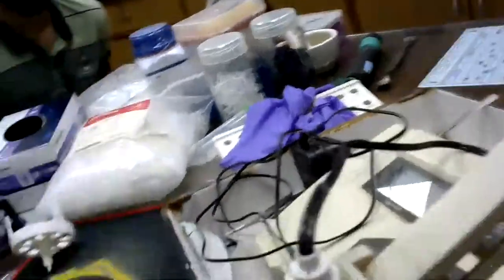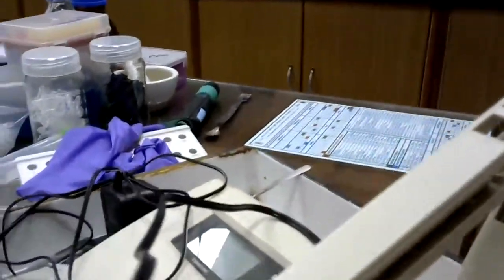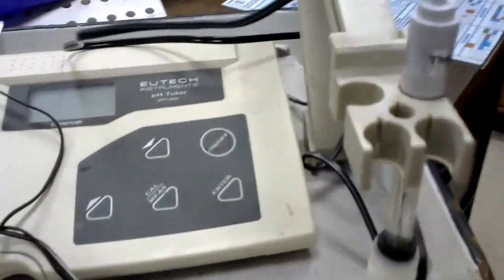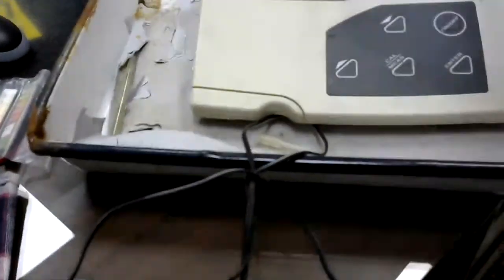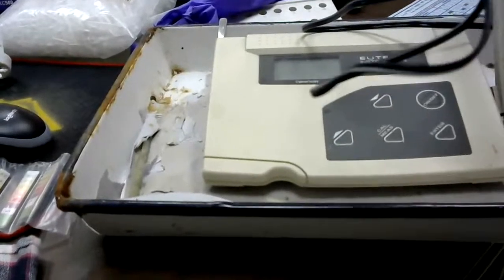So to be very precise, we have to use a pH meter. So I am trying to show you the pH meter. This is the pH meter, which can be used for measuring pH very accurately. Okay, so this is the pH meter, and this is the power supply.